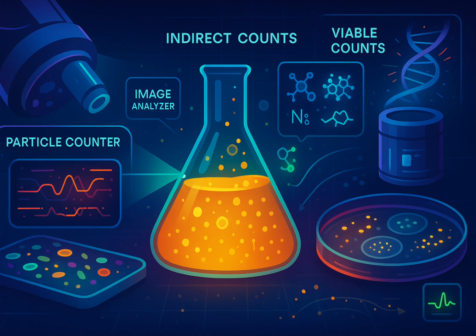Advantages? Speed. Incredibly fast. Thousands of cells per second. High sensitivity, high specificity if you use the right stains. And that sorting capability is unique. Disadvantages, besides the cost, which I'm guessing is high? Very high cost, yes. Complex instruments, too, need skilled operators. And sample prep can be a bottleneck. Getting everything into a single cell suspension, staining, that can take time.